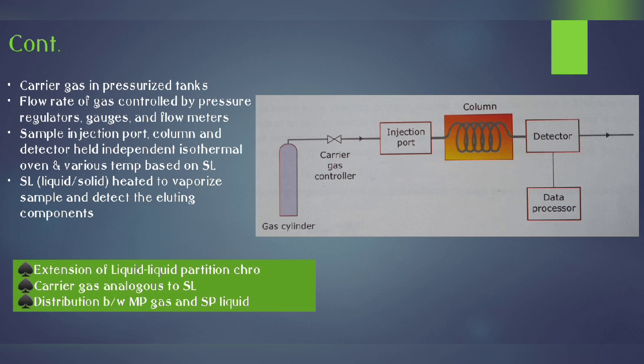It is also an extended version of liquid partition chromatography. Carrier gas is analogous to solvent, so the molecules are separated between the mobile phase gas and the stationary phase liquid.